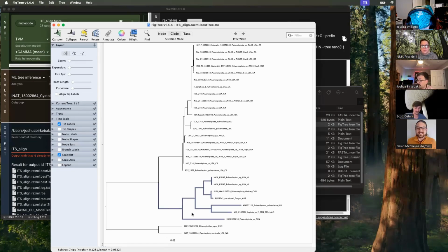And here we have two clear clades. We've got Pulverulenta, question mark, and then we've got a whole other section of interesting things here. We've got something from China, something from Australia, something from India, something from China and Australia, potentially named Oliviere, and another species from Hawaii.